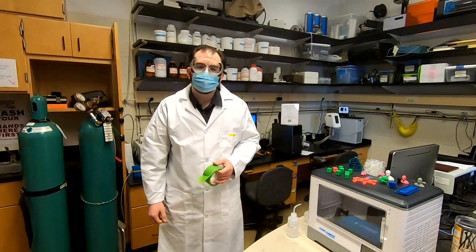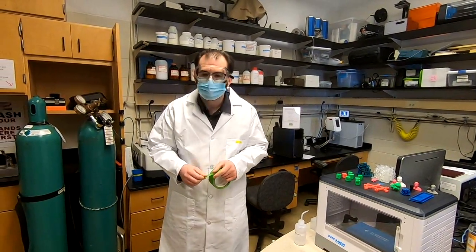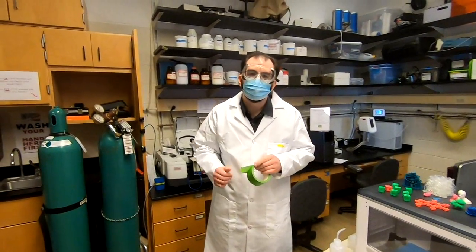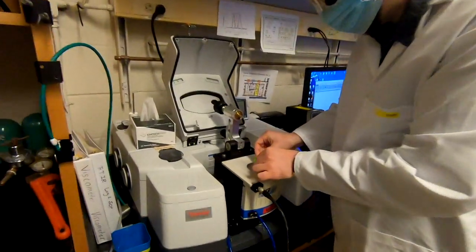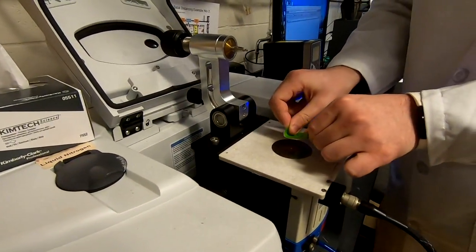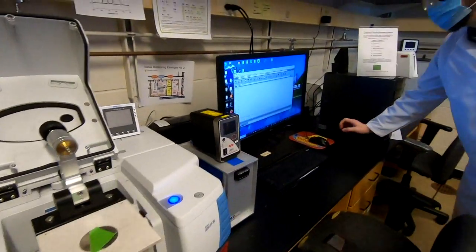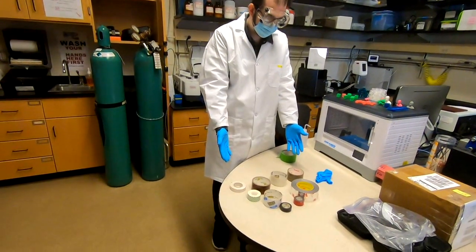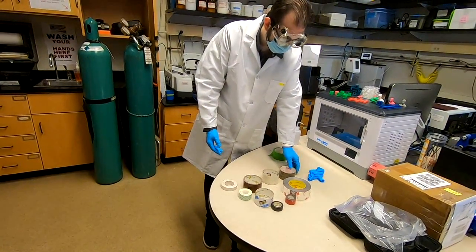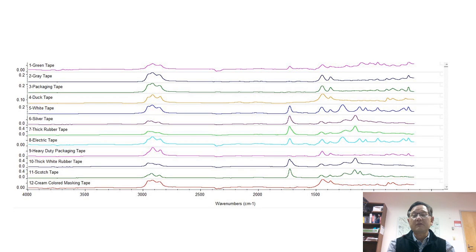Hi, I'm Keith Denivo. I am a fourth year student at Professor Yu's laboratory. Today, we are going to measure the different adhesives that are found in common household tape. You just have to simply take the tape and put it on top of the diamond crystal that's right here. Press it flat, then you can just collect the sample. These are several different tapes that are commonly found in the household. They usually have different adhesives that you're able to measure using the IR.